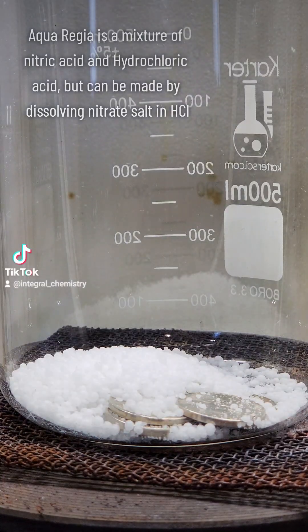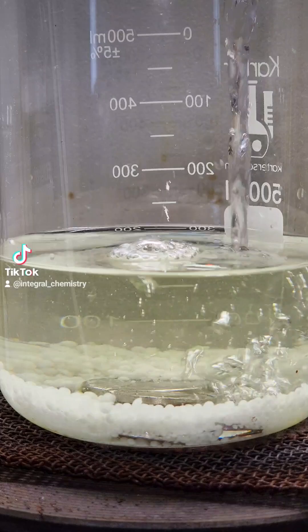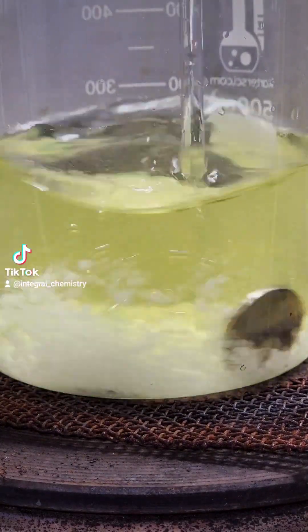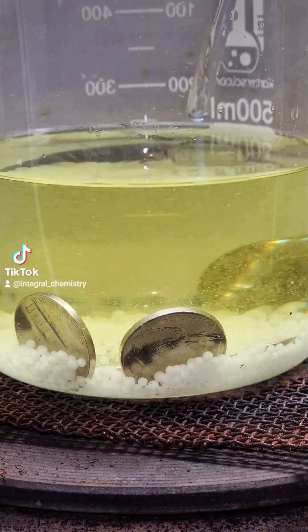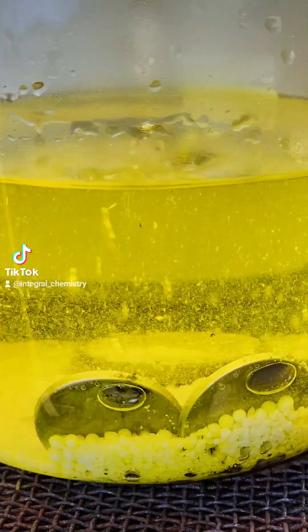Typically aqua regia is made by just mixing hydrochloric and nitric acids, but you can also make it by dissolving a nitrate salt like sodium nitrate in concentrated hydrochloric acid. Aqua regia has a distinctive yellow color, and you'll know you've made it when the solution turns yellow.